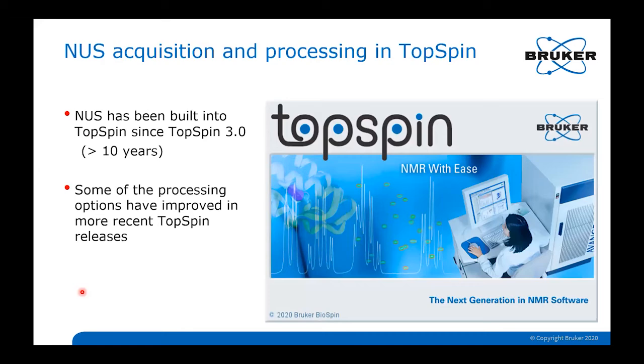So I now want to go on and spend just a little bit of time showing how to do this in TopSpin. My apologies to people who are using JEOL or Varian Agilent instruments. I want to make sure that people who are using a Bruker instrument know how to set this up in that software. Again, all these techniques can be done just as well on a JEOL or Varian instrument. The details of the parameter names and what flags to turn on are going to be a little bit different.